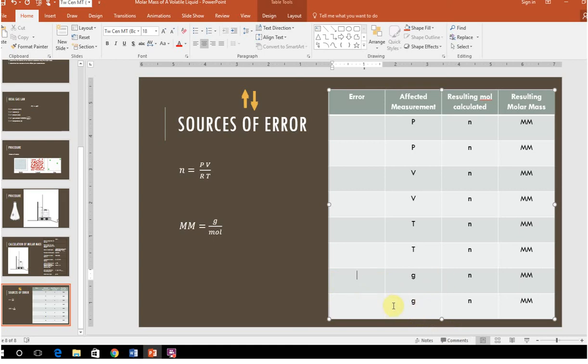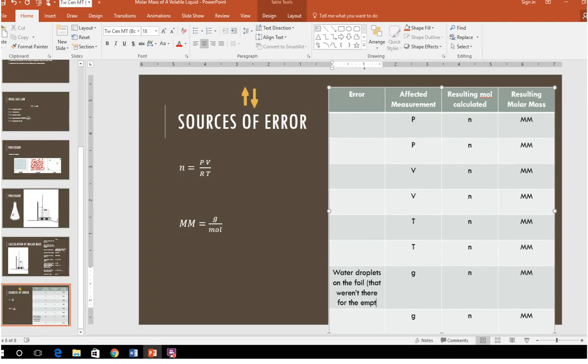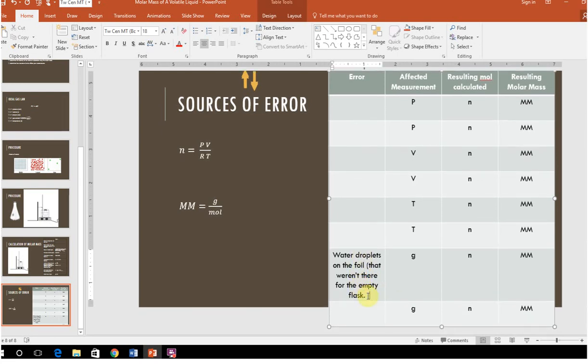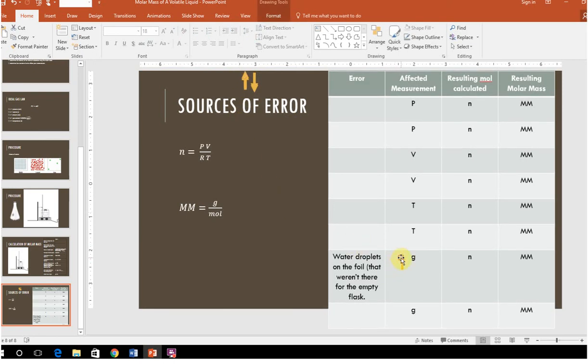So let's just look at grams. Maybe when I went to measure my grams, there were water droplets on the foil that weren't there for the empty flask. So this is something that is going to be contributing to a mass that is not really from the vapor itself. It's not coming from anything else, but it's contributing to the mass. So it's going to make my grams look too high.